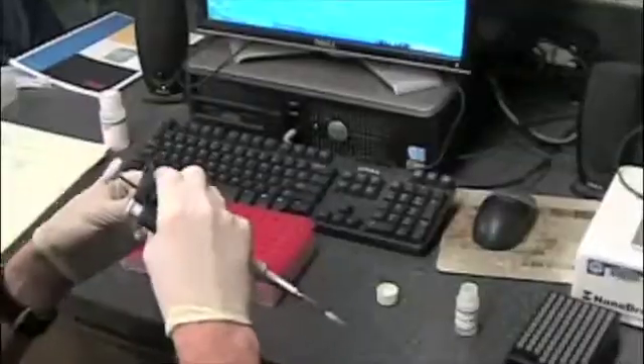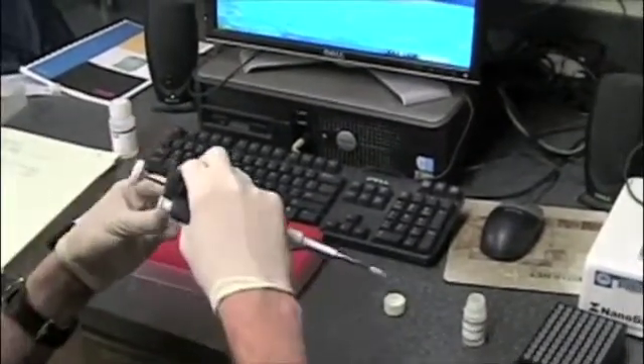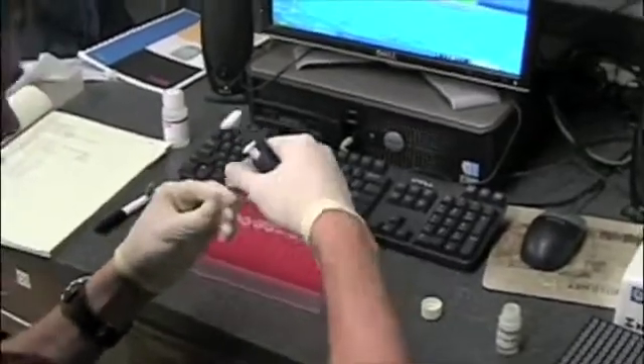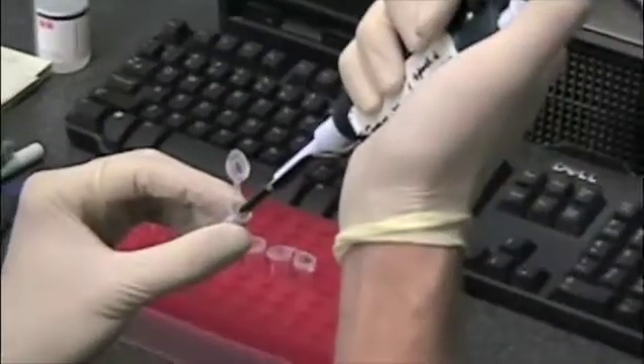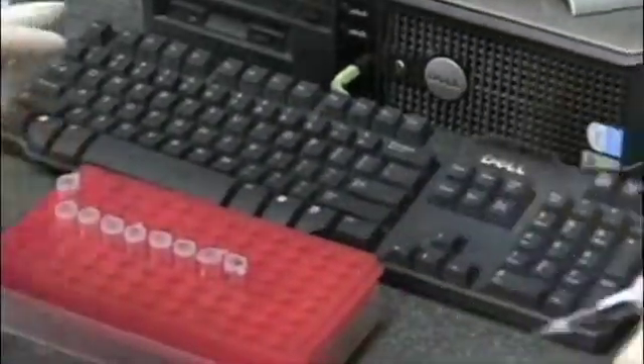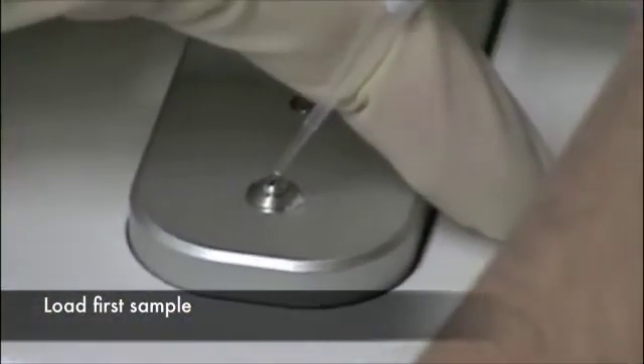There's our blank. Now we do sample one. It's a good idea to flick it a little bit just to make sure the solution is uniform — there's no gradient of DNA going across it. Usually isn't, but it's not a bad habit. Place the sample right on the bead.